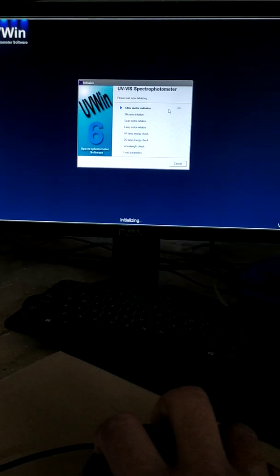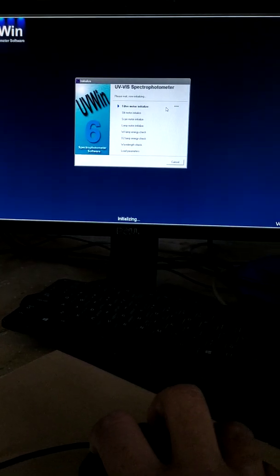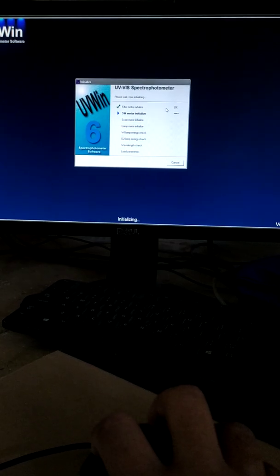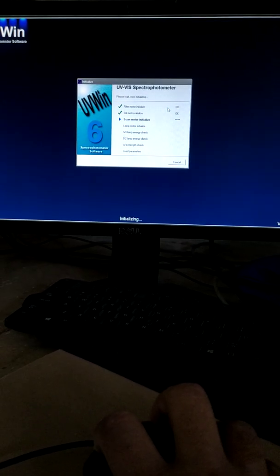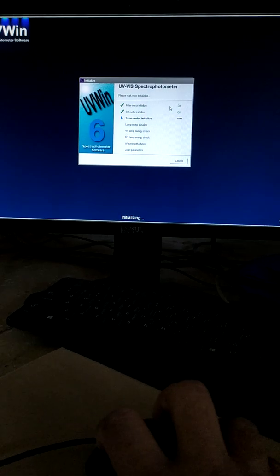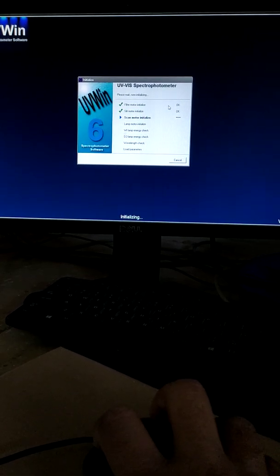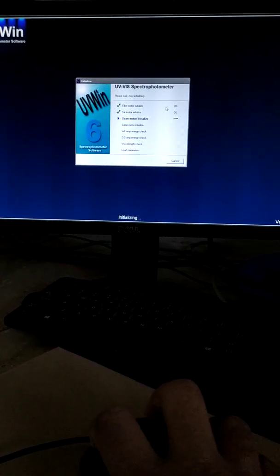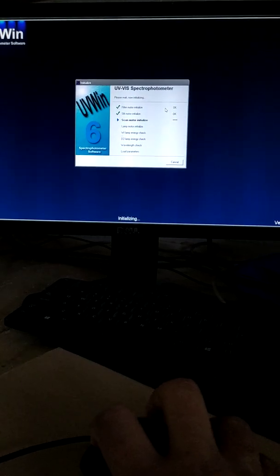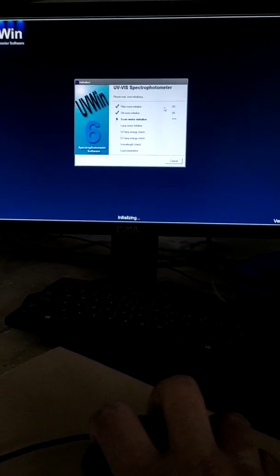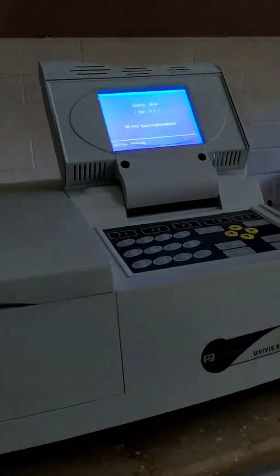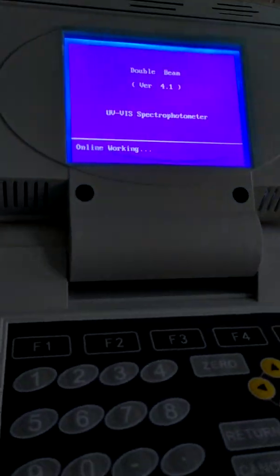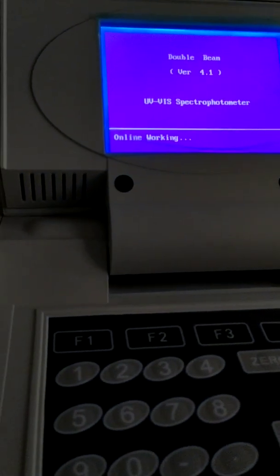The system has detected the control mode as PC mode and has been initialized. It is now controlling through computer. The main unit is now in control of PC and is working online.